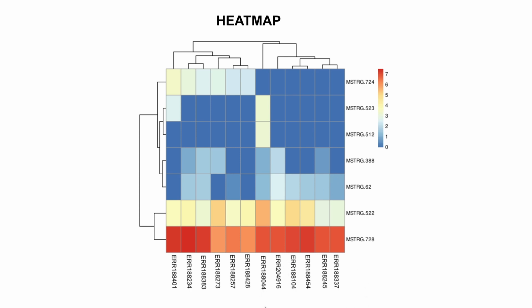If you look at the genes here, there are two main clusters. We have cluster 1 here, which has high expression levels, and cluster 2 here. So comparatively, we have two groups, those that have been expressed at high levels, and those that, comparatively speaking, have low levels. One is higher than the other. These two have similar expression patterns, and this other group here also has similar expression patterns.